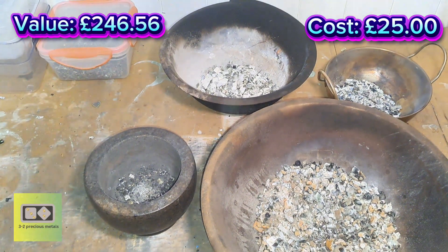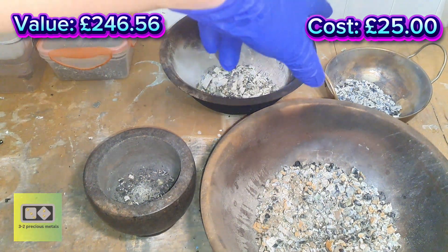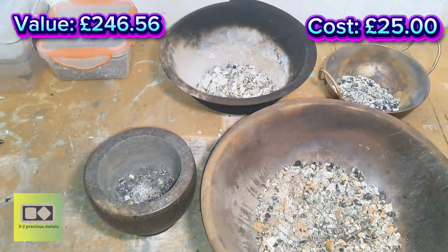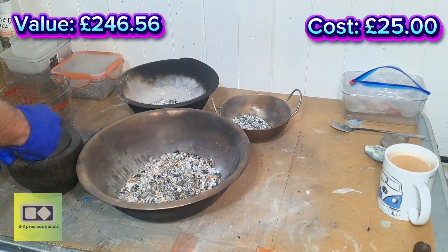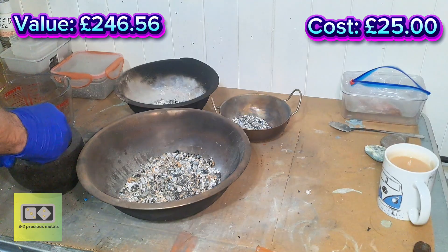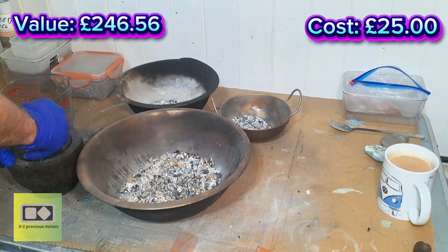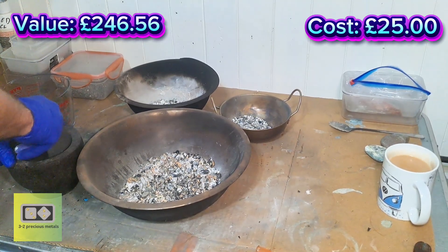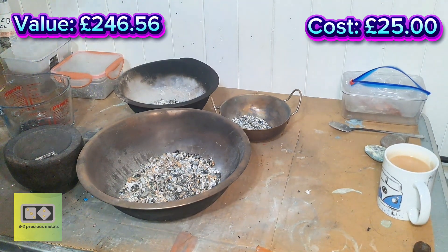Once everything's crushed I'll throw it in the beaker and then I'll add nitric acid on the capacitors, and I'll do the same on the transistors and the ICs. I can't really see this material clearly because a lot of the silver on the tantalums is attached to the electrode — with the other capacitors I'm not even sure where the silver is. I'll just crush it all up as best I can and throw it in the beaker.